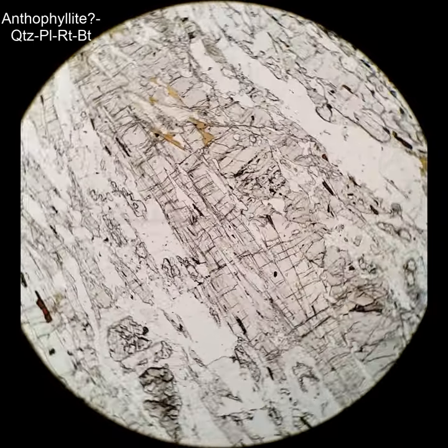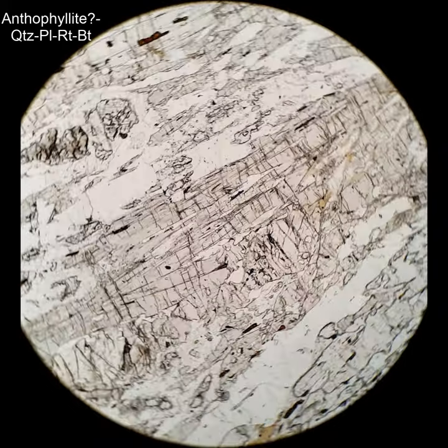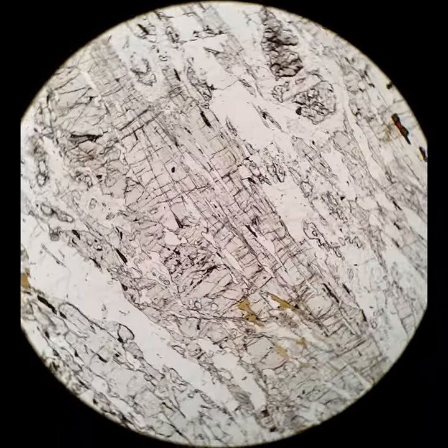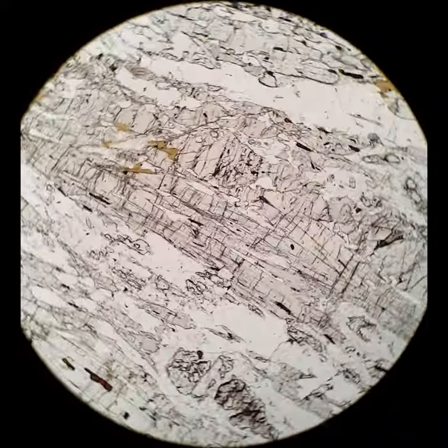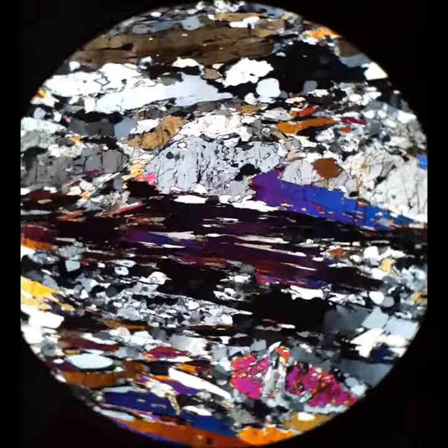I won't lie to you — I'm not sure if this is anthophyllite or gedrite. There is gedrite in the section, I know that. But is this pleochroic or not? I have trouble telling. If it's pleochroic, then it's gedrite; if it's not pleochroic, it's anthophyllite. The only way to be certain is to either get a chemical analysis on it — because gedrite has aluminum and sodium in it — or to have some kind of spectroscopic measurement that could distinguish the two different amphiboles.